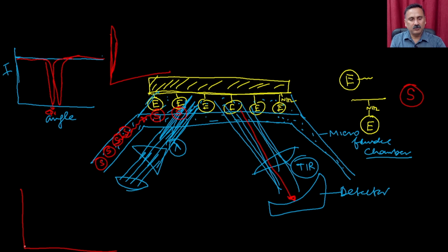It's going to show me like this: the angle is increasing, and then it will reach a plateau. It keeps increasing, and then ultimately it keeps showing me the same angle. This means now the system got saturated.